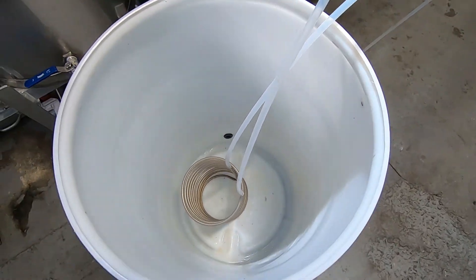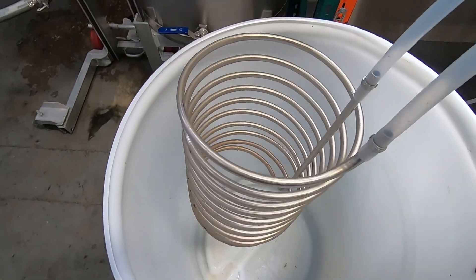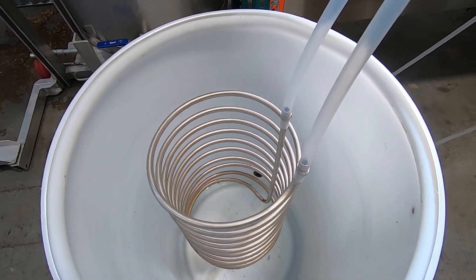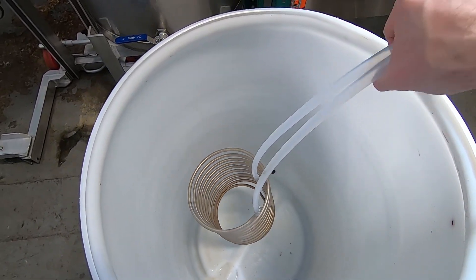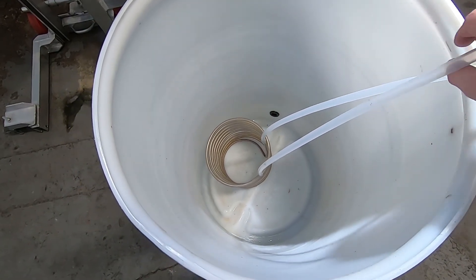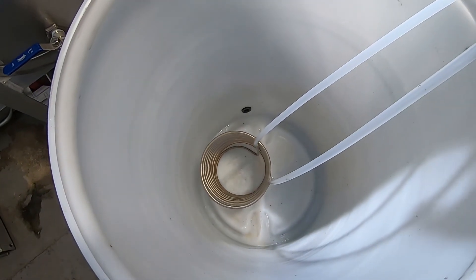The easiest way to do that is with just a basic coil. I've got a stainless steel coil here — this is a 3/8 by 25 foot — and you can get these at most brew shops. They're pretty easy to get and pretty inexpensive.